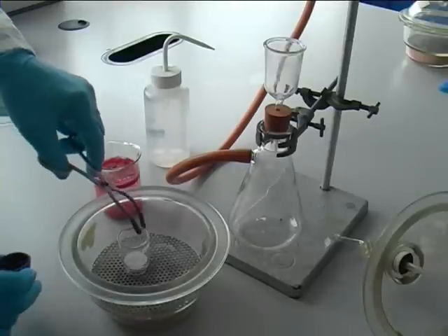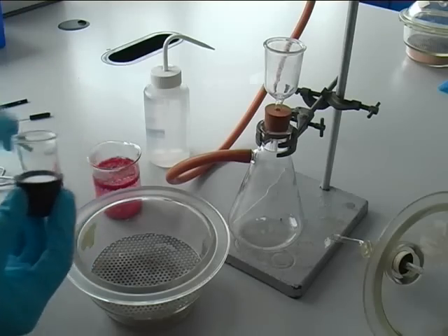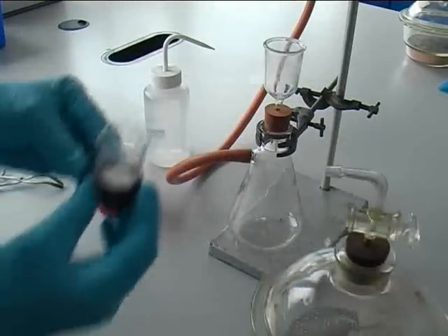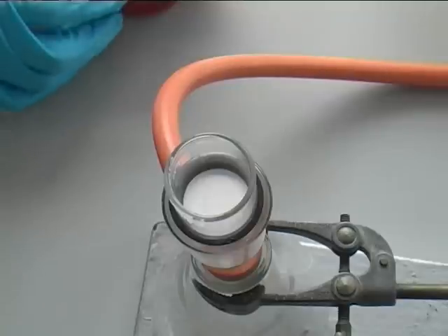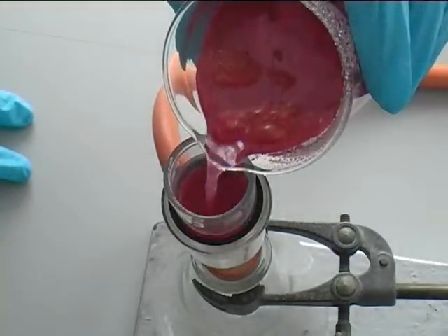Remove the sinter from the desiccator with the tongs and put into a gooch funnel. Turn the vacuum on and filter the nickel complex. Do not fill more than half of the sinter.